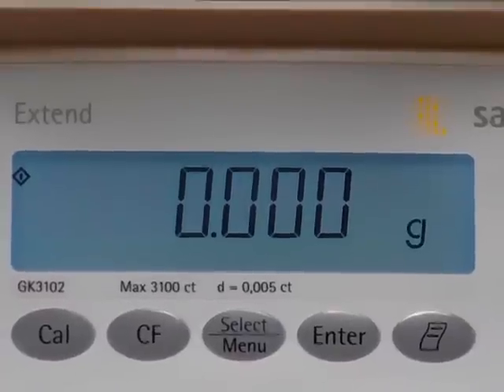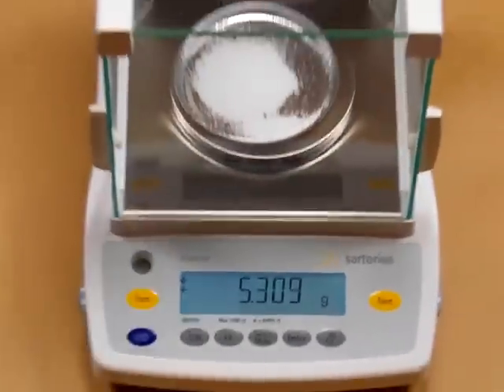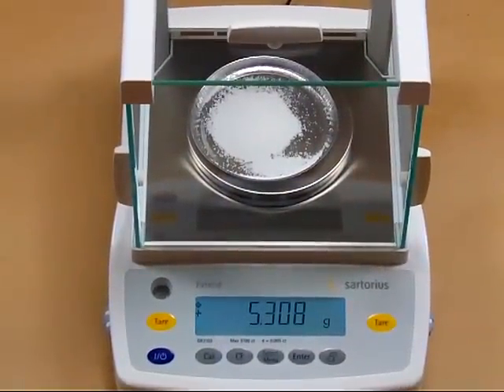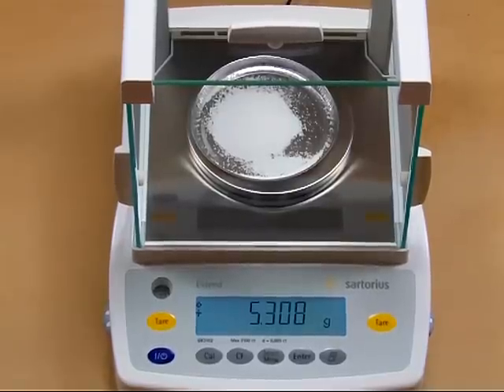We have a sample dish here with table salt for a demonstration. You'll see what's on the platform is 5.308 grams. You can change the weigh mode.